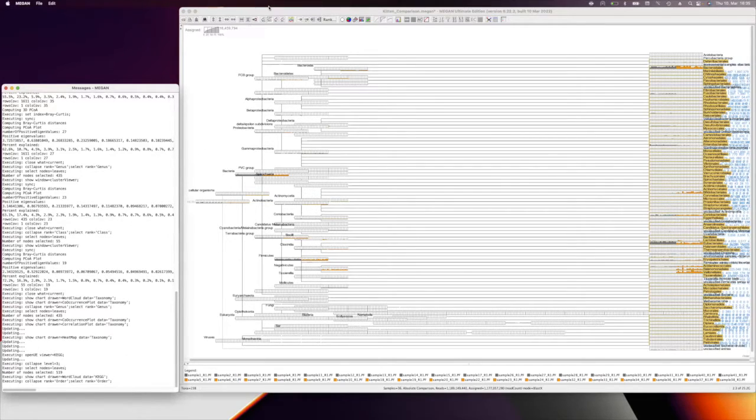So in other words, this is a translation of my input that I've just given through the graphical user interface. And I can use this to write a script that will perform what I would otherwise do in the graphical user interface. So why is this useful?